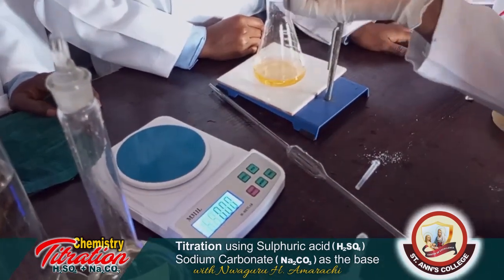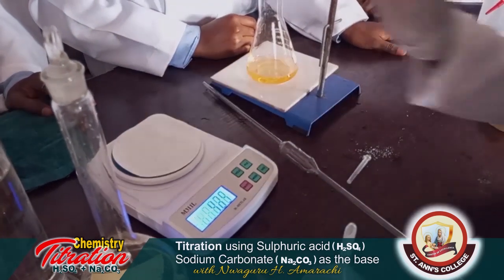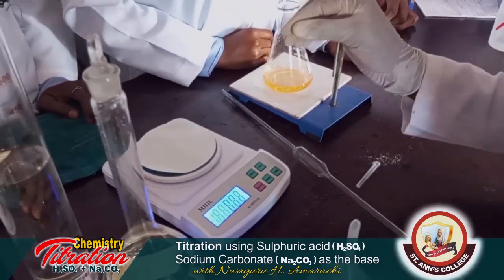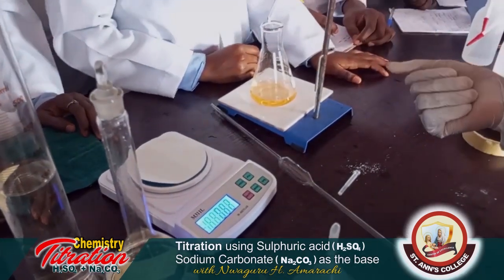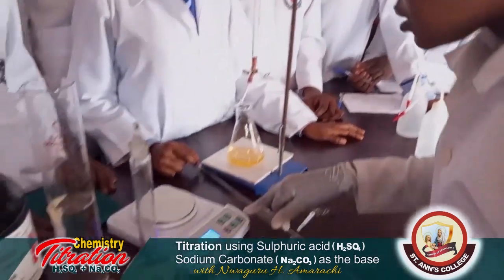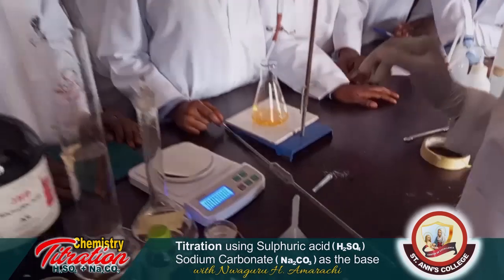Now weigh the filter paper, and you can see the filter paper has 0.82 grams. Then for you to carry out a particular measurement of your base, you press the tare button. It will return back to 0.